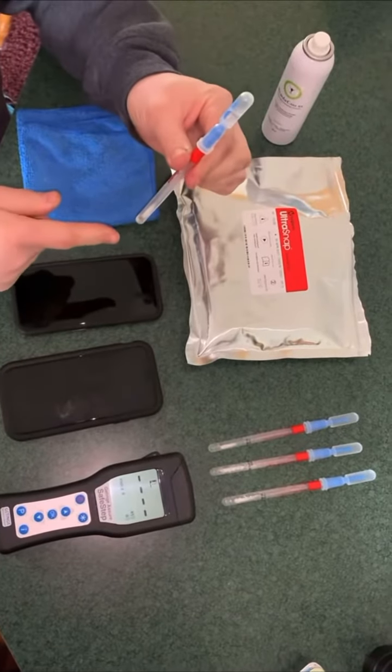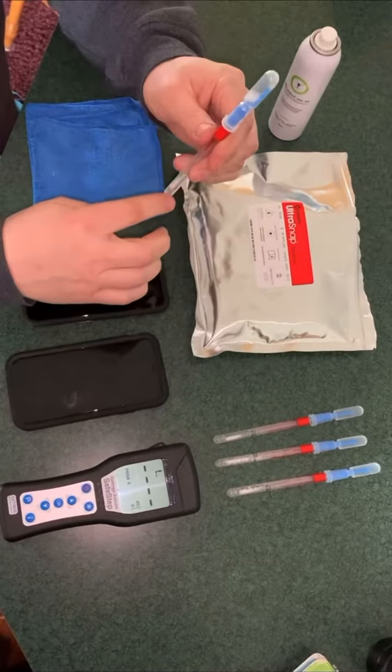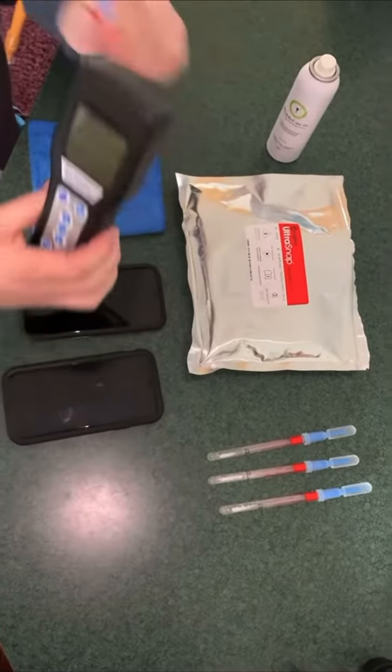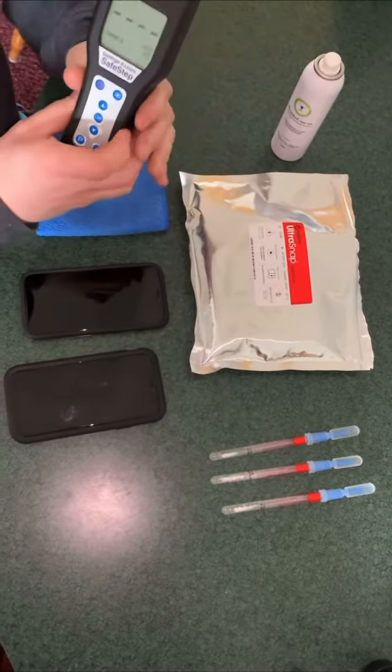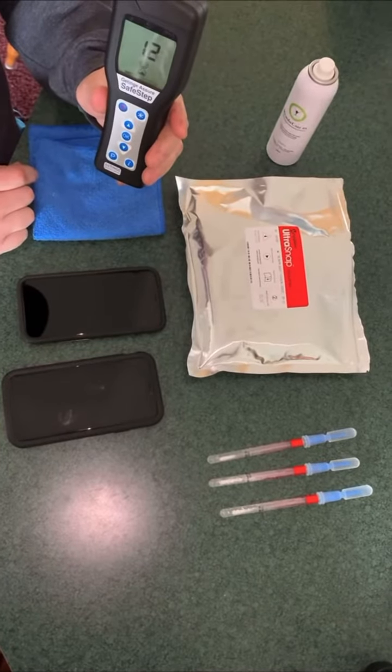It's an ATP strip. I just wipe the surface, then shake the fluid that comes from the top down. It washes this q-tip off, puts it in solution, and then I take it over to an ATP meter, open the top up, and set it in here. This ATP meter is made by Gettage. In about 15 seconds, it's going to give me a reading.